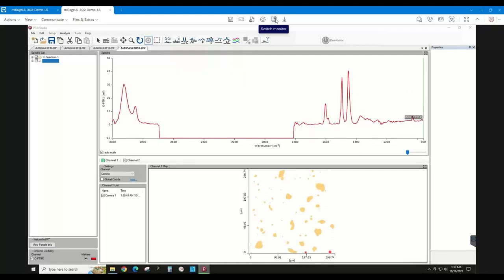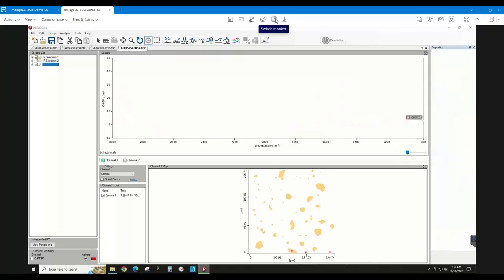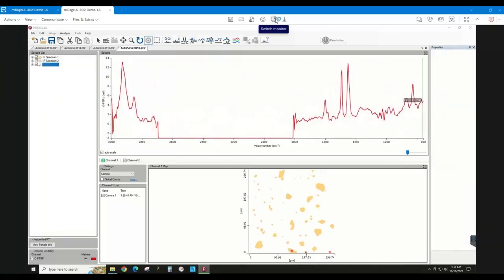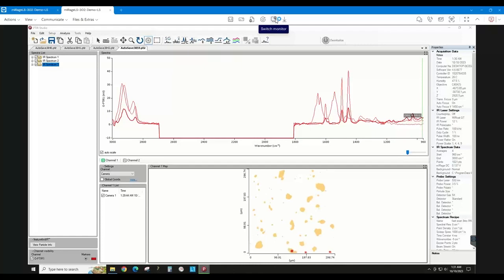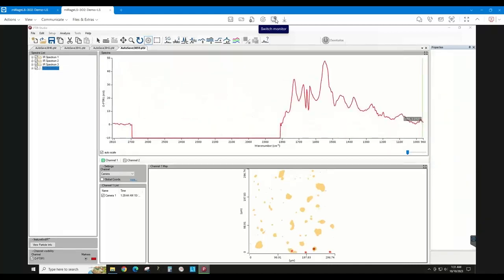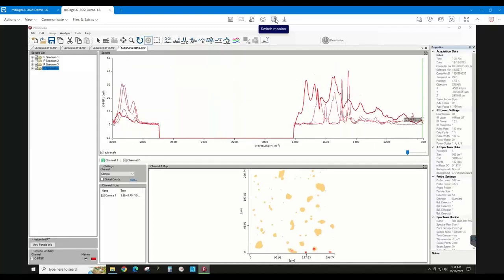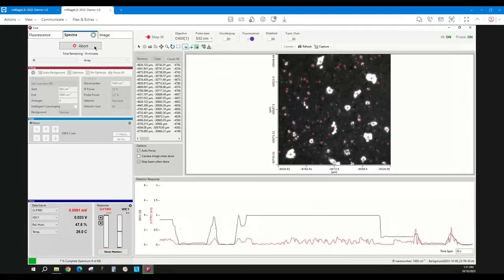Okay. So you can see the signal noise is actually really good. I could have probably gotten away with fewer scans on this one. 1 or 2 scans even would have been enough. So we'll do maybe just 2 more. So we'll switch back and abort that now.